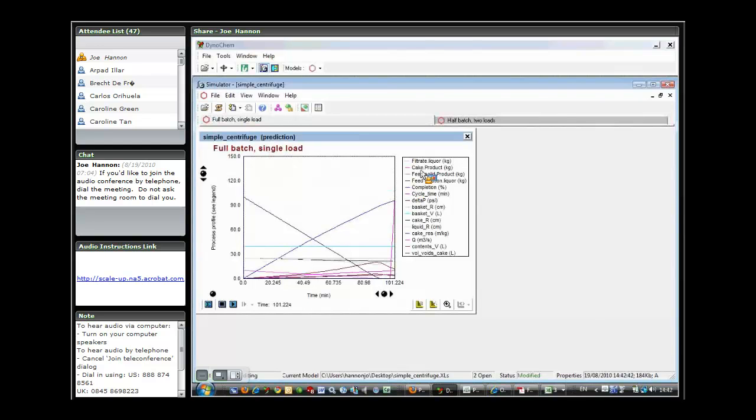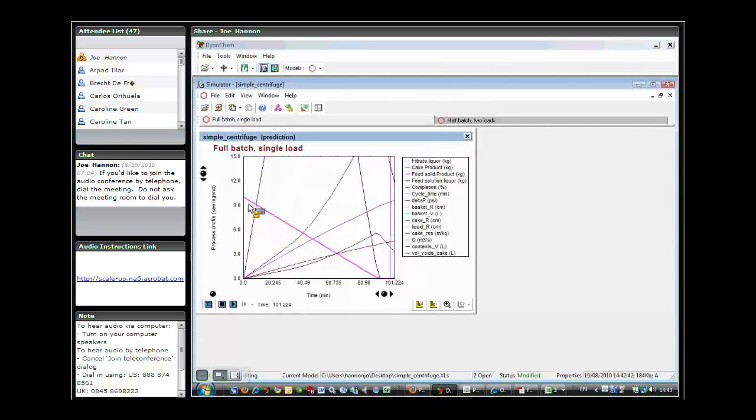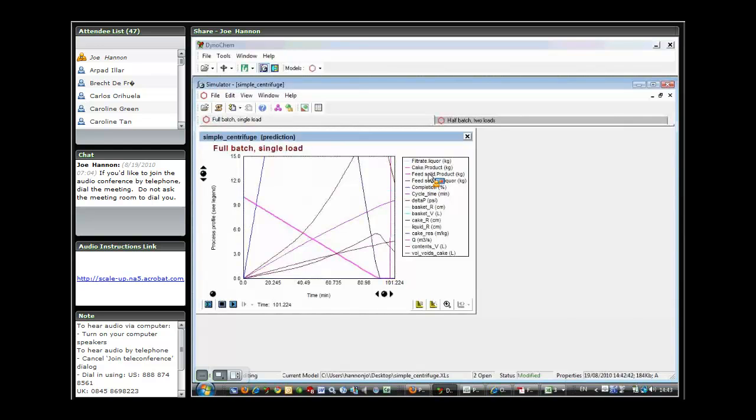As we feed the material into the centrifuge, if I click on feed solid product, that's the amount of material that we're looking to feed. In this case, it's over 90 minutes. We can see that that drops, in this case, linearly because we're feeding at a constant rate. So over the 90 minutes, we're charging all of the material to the centrifuge.